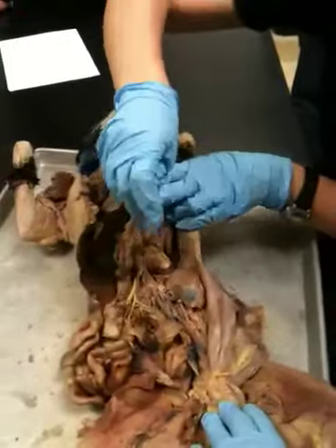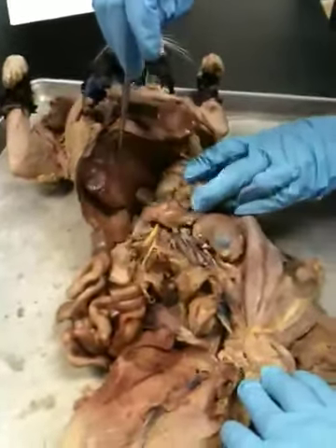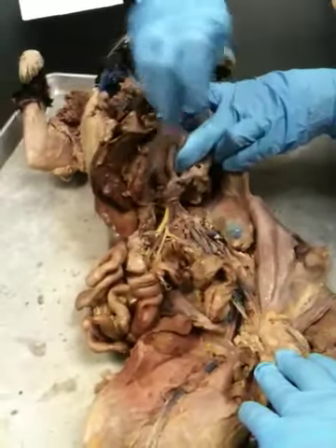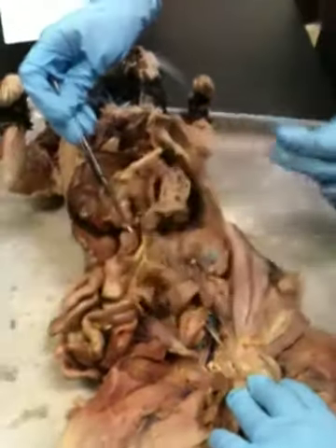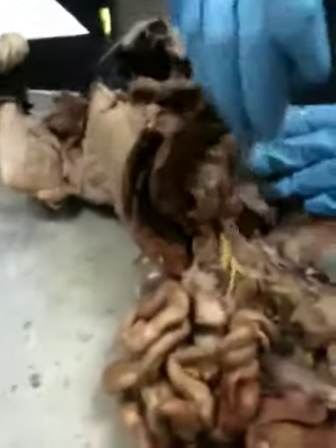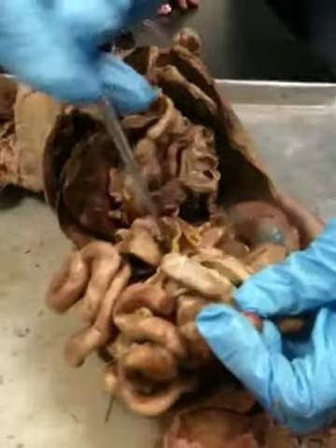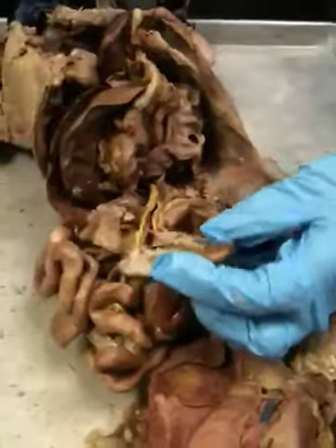There's one coming out the other way too. Let's see if there's any red coming off the liver. Probably that red one right there, heading towards hepatic. Yeah. Which one was that? That was hepatic. And then if we have any small intestine here, let's see. Yeah, here we go. Small intestine. Big red vessel, superior artery. That's the superior mesenteric.